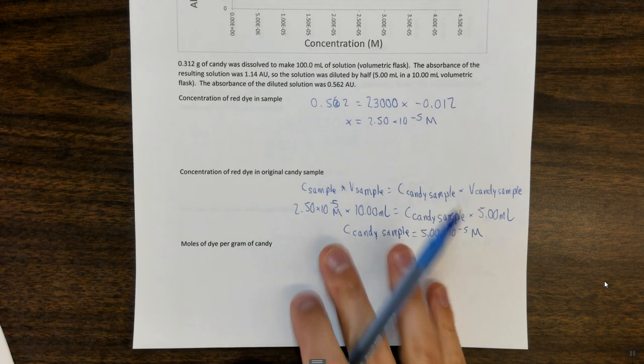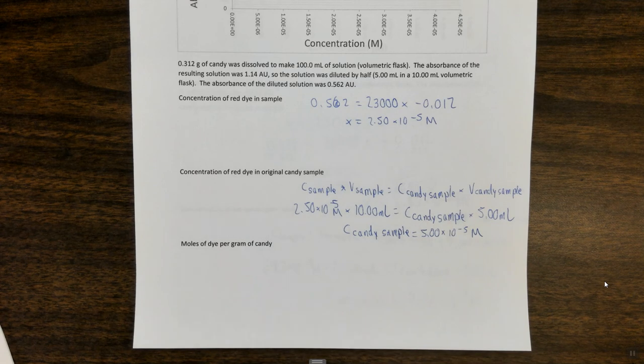The units here are kind of up to you. You could do grams of candy, or moles of dye per gram of candy. You could probably do grams of dye per gram of candy. Gram of candy is probably a good thing to use because you're measuring the mass of the amount of candy that you're using. I guess if you wanted to figure out the mass of a whole candy, you could find the moles of dye per candy, and that would also be a unit of concentration. So you don't have to use what I'm using, but this is what I'm going to use.